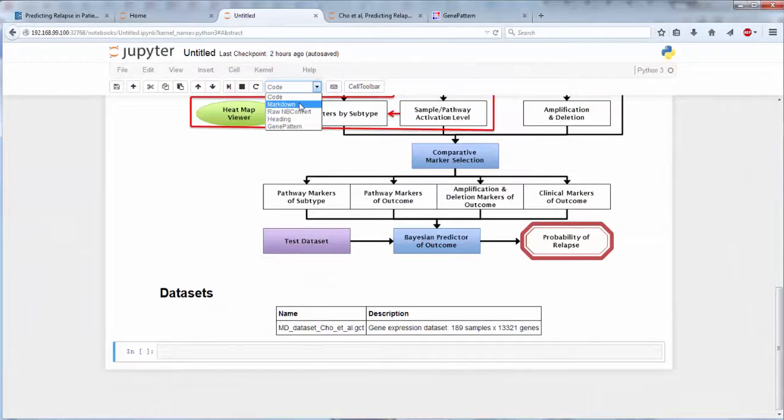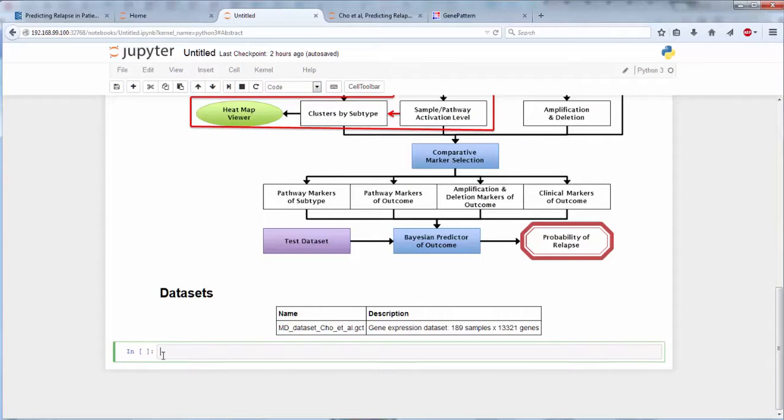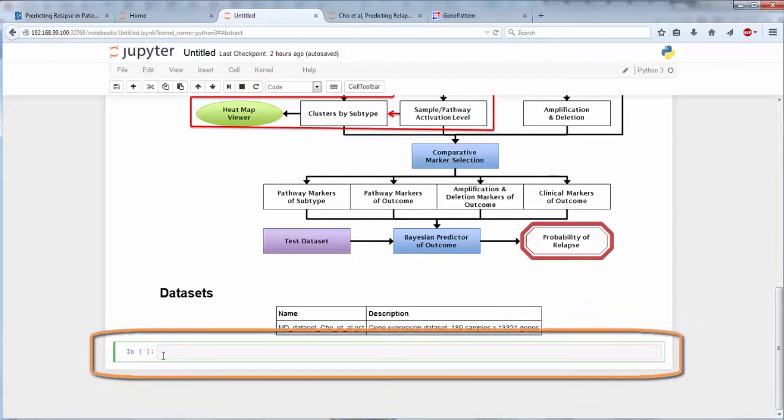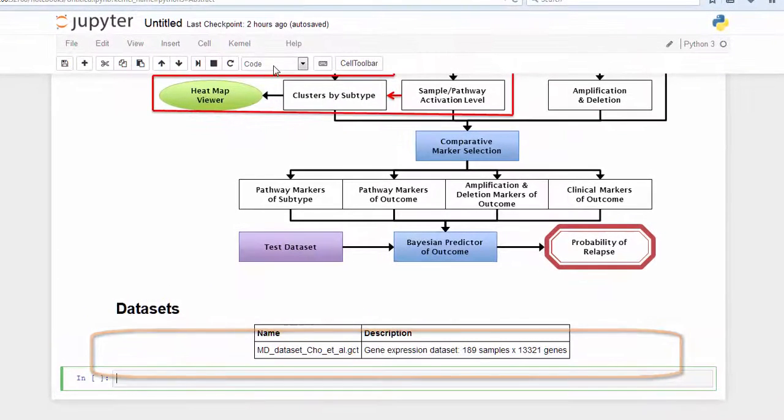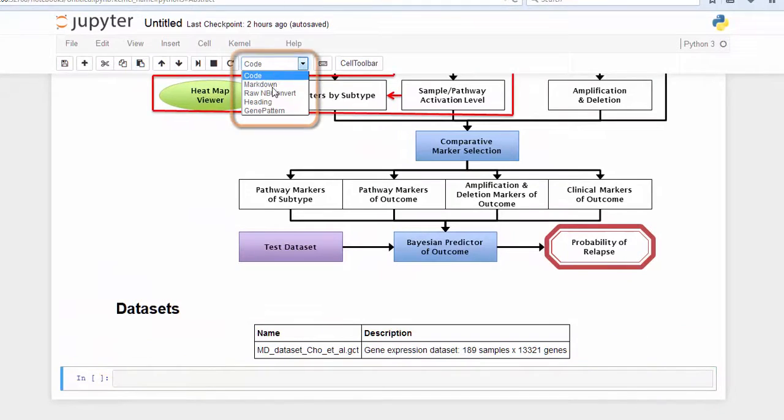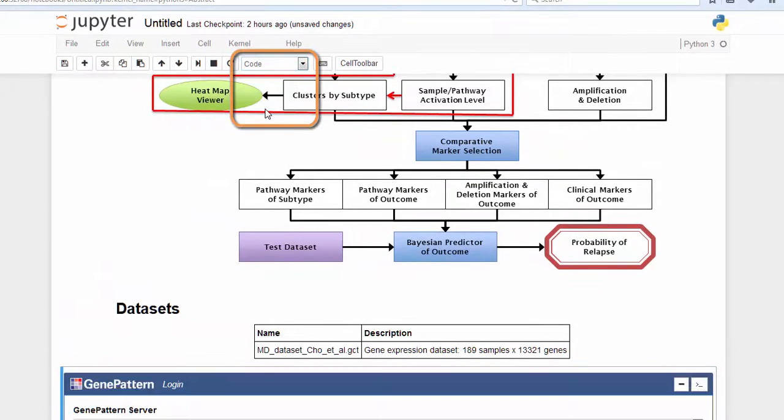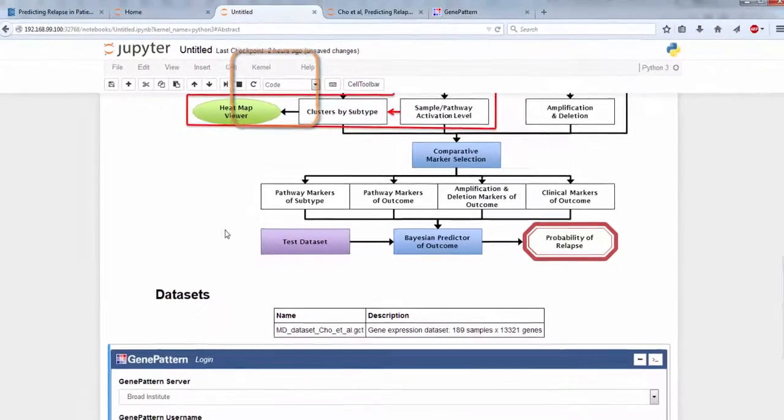Now we'll demonstrate the additional capabilities that the GenePattern Notebook environment provides. First, we need to create a new GenePattern login cell. To do so, select any blank cell and change that cell's type to GenePattern, using the cell menu found in the Jupyter toolbar.